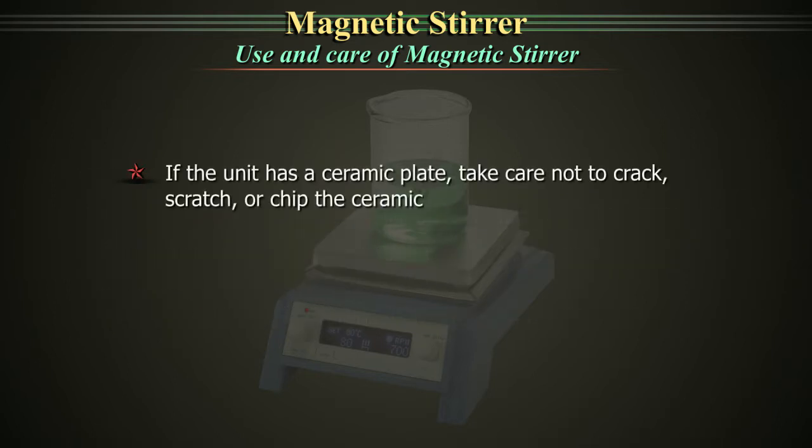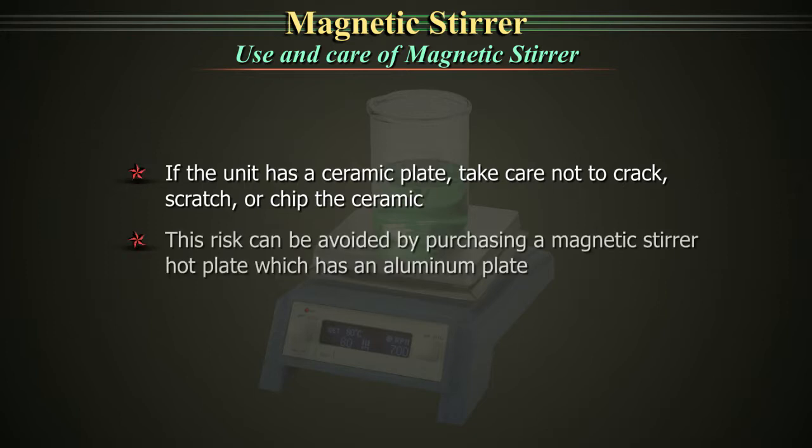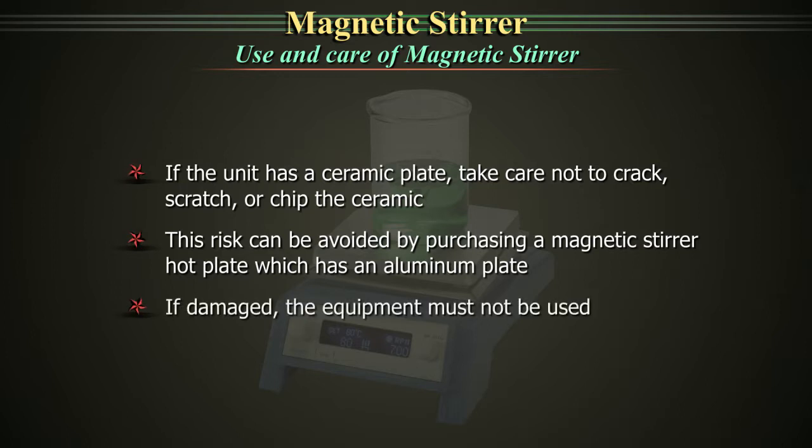If the unit has a ceramic plate, take care not to crack, scratch or chip the ceramic. This risk can be avoided by purchasing a magnetic stirrer hot plate which has an aluminium plate. If damaged, the equipment must not be used.